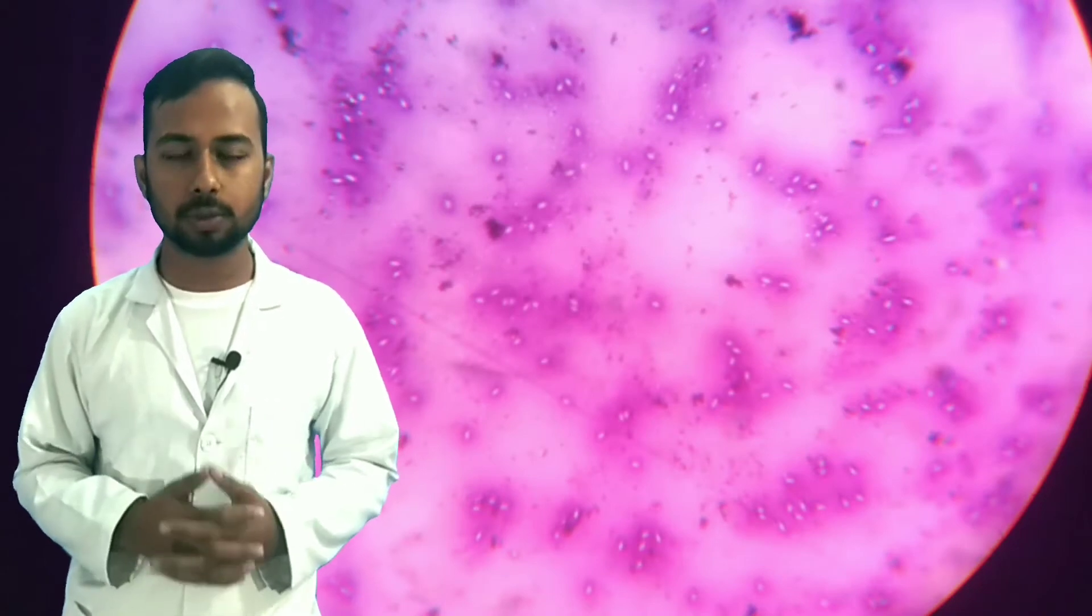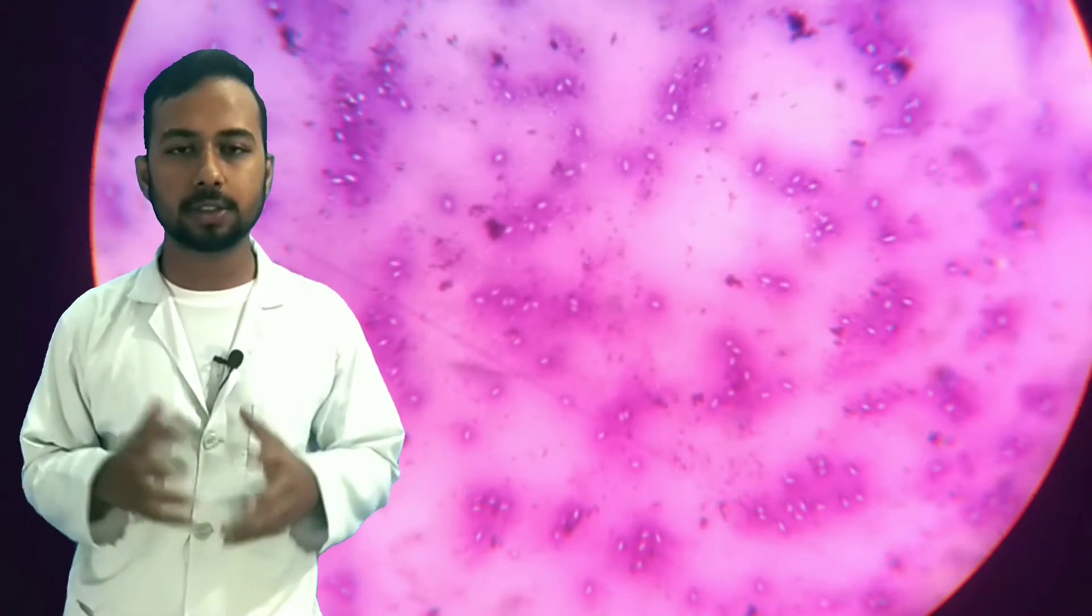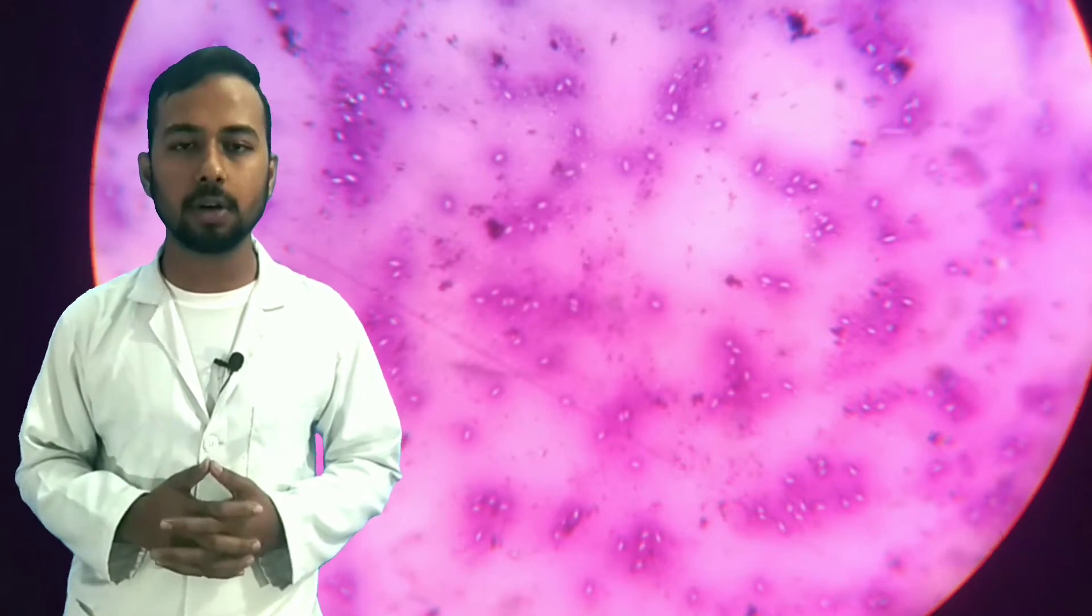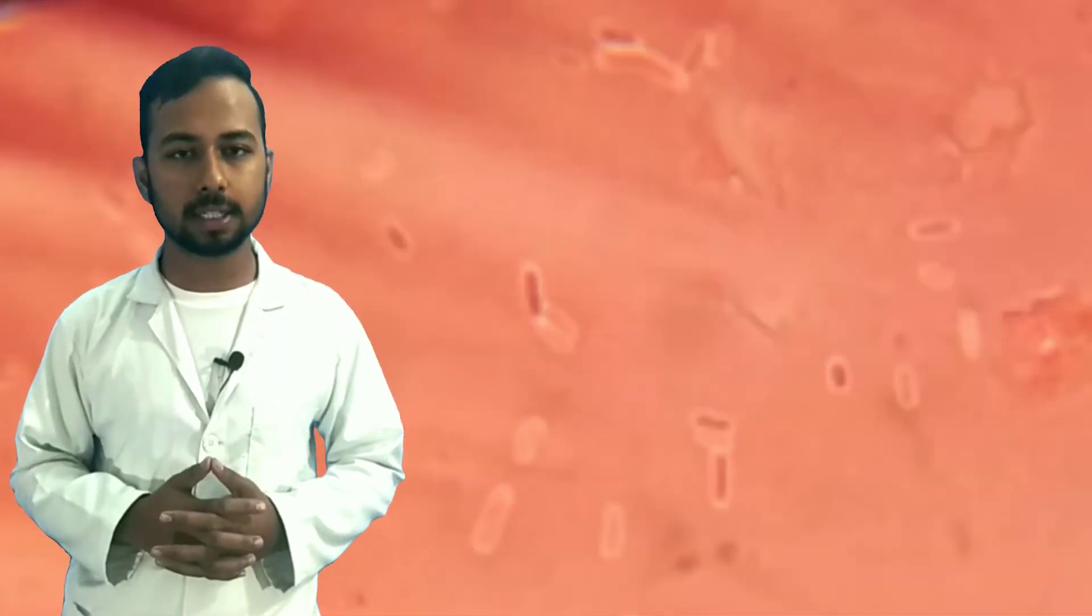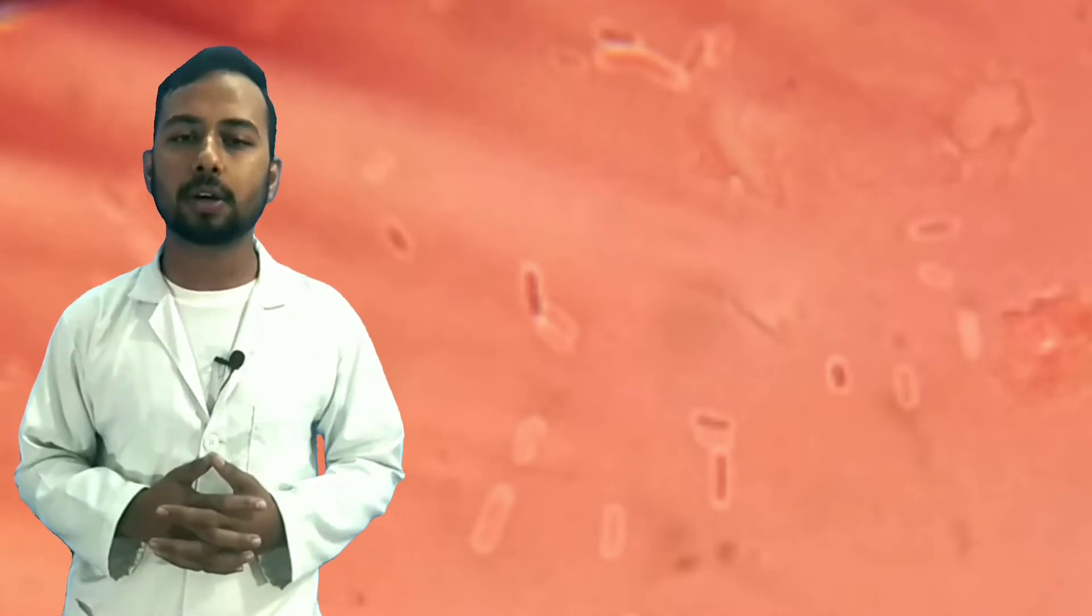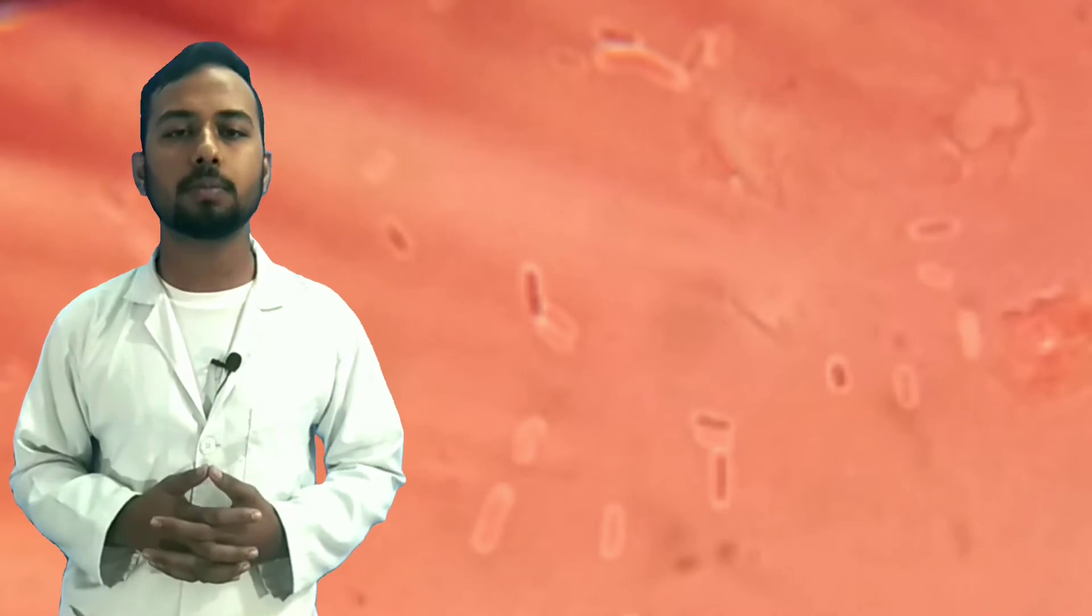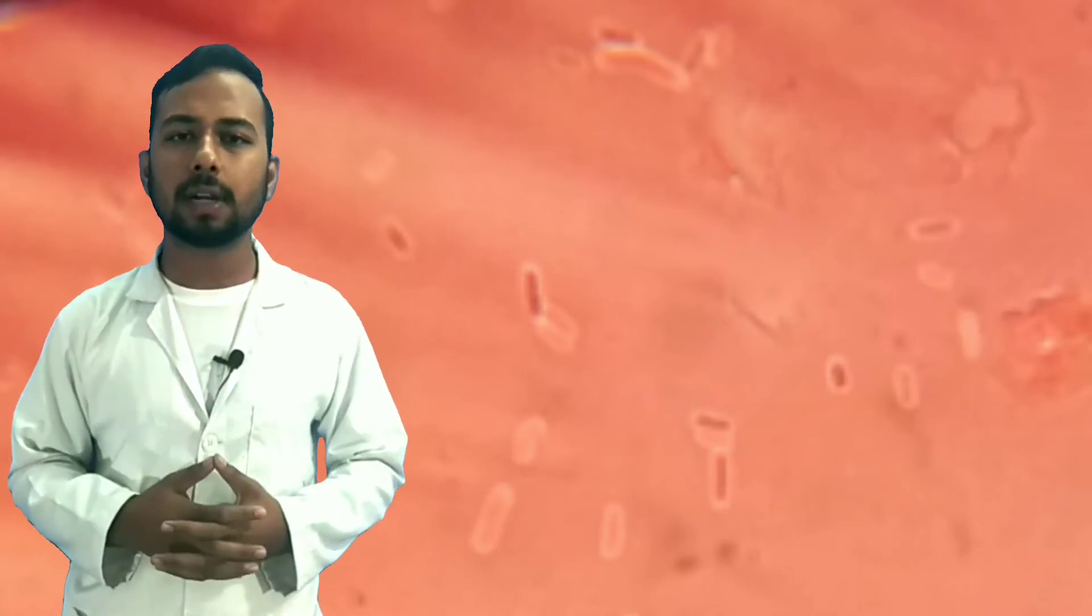Basically in the staining, two types of stains are used. First is negative stain that is used for the staining of background of the capsulated organism. And second, the counter stain that is used to stain the microorganisms inside the capsule, so that we can differentiate between both of them.